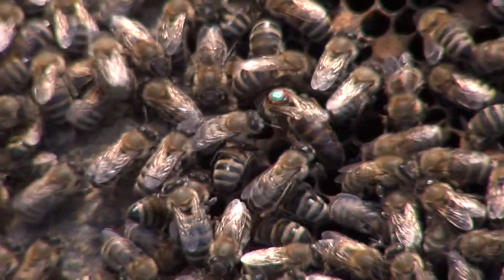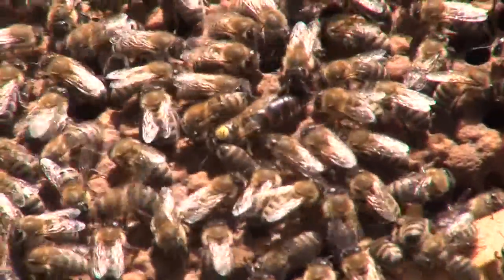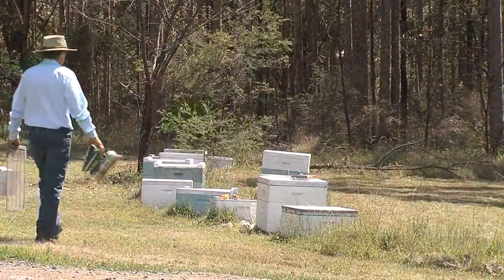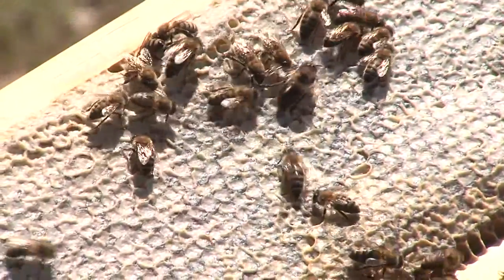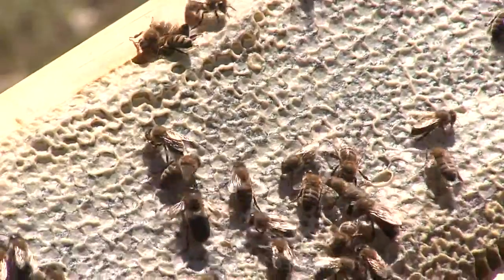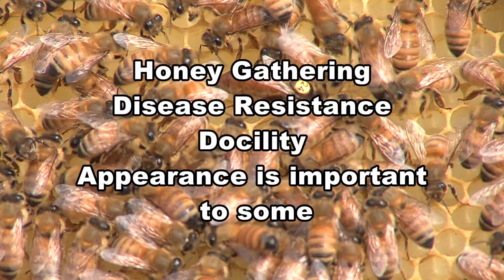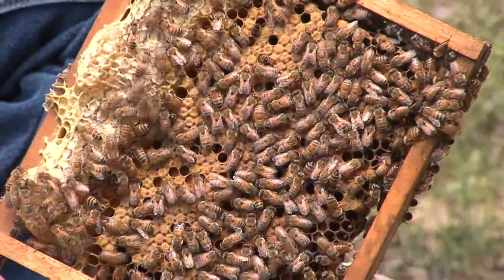The strain within the race determines many of the characteristics. Inseminated queens can be used in colonies to produce honey and/or pollinate crops, or be used as breeder queens to produce queens that can be open-mated. Artificial insemination can be used to enhance colonies by controlled mating of desirable genetic traits and maintaining them. For example, comb honey producers prefer bees that whiten the caps of honeycomb cells. Desirable genetic characteristics include honey gathering, disease resistance, and docility. Appearance is important to some apiarists. Hygienic behaviour is a very desirable genetic trait, as the resulting colonies have high resistance to brood disease by having a healthy brood pattern.